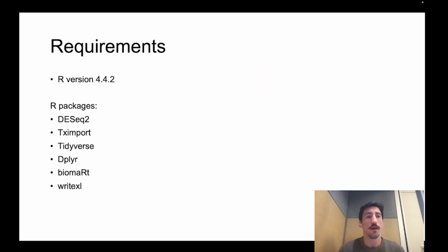Before we get started, the R version I'll be using today is 4.4.2, and these are the 6 packages that need to be installed before you get started with this analysis. All right, well, let's get started.